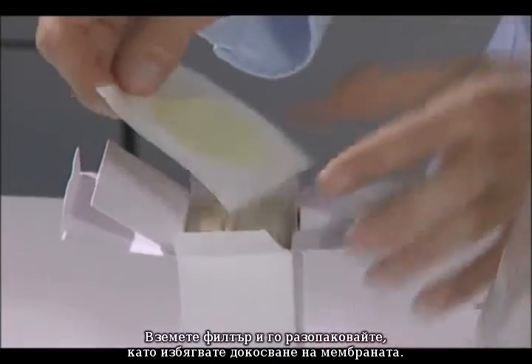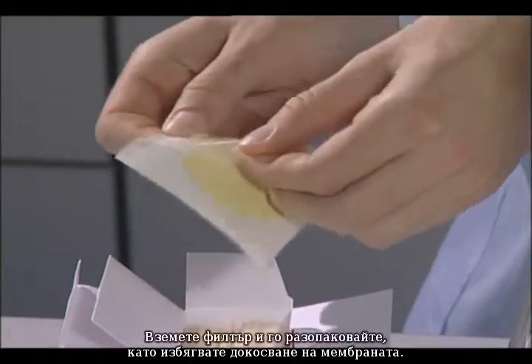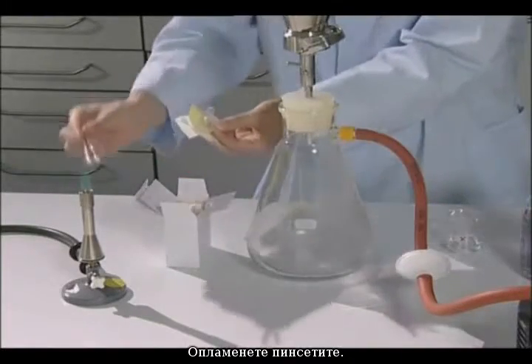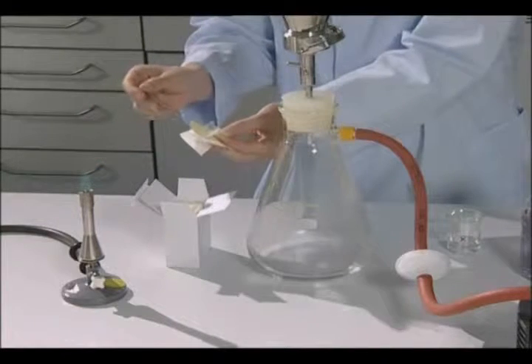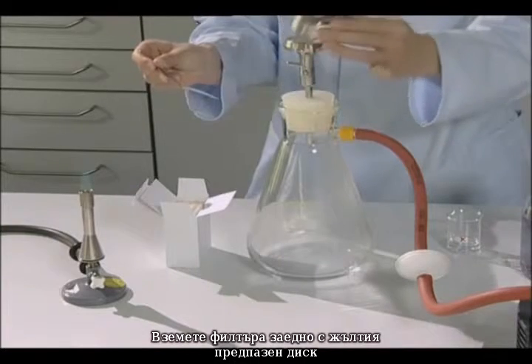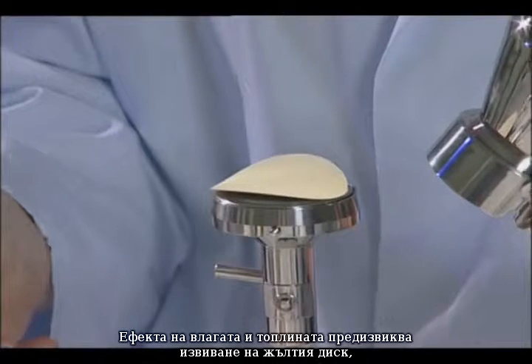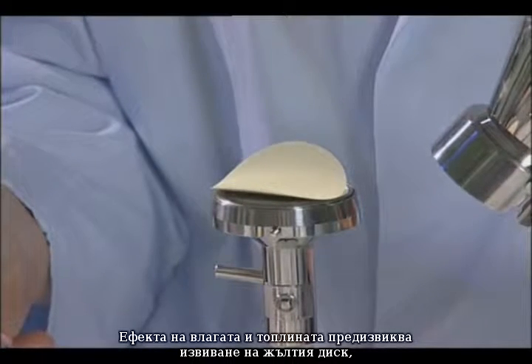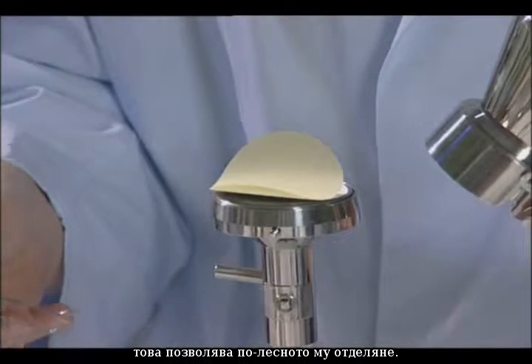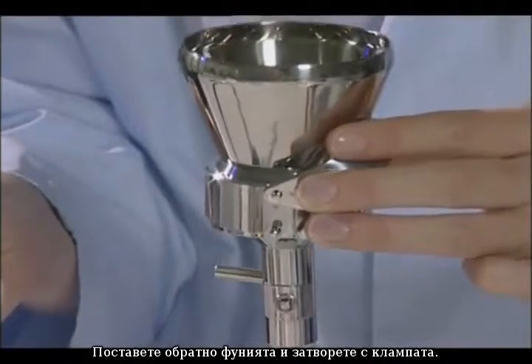Remove the filter from the packaging and open the envelope carefully in such a way that you avoid touching the membrane. Flame the tweezers. Remove the filter together with the yellow protective disc and place on the filter support. The effects of moisture and heat cause the yellow disc to curl, which allows it to be removed easily. Place the funnel back on and close with the clamp.